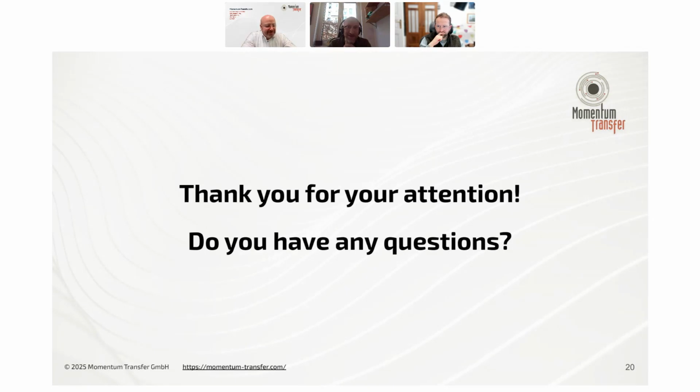I'm sorry. I'm sure there are other people in this call, I can see some names, who I bet know more about that than I do. My background is mainly in looking at nanoparticles and stuff where you never really care about sieving anything or worrying about preferred orientation or large particles. So no, I'm sorry, I don't know.